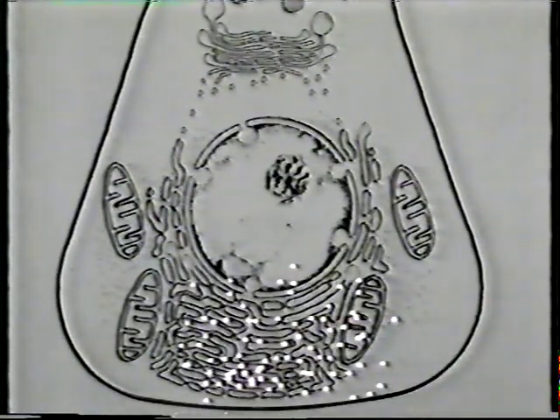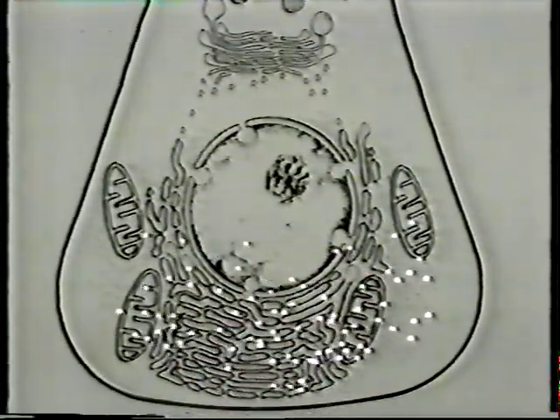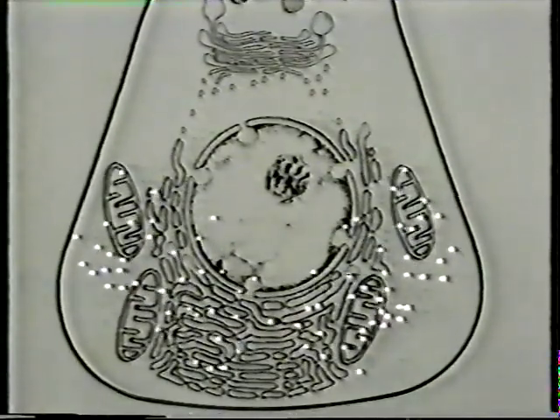After fixing and sectioning the pancreatic tissue, a photographic emulsion is spread over the grid and stuck in this glass slide for ease of handling. When radioactive particles interact with emulsion, silver grains are deposited, and it's these which indicate the position of the label. The longer the period of chase, the further will label have moved through the cell. Dr. George Palade from Yale University pioneered this work.